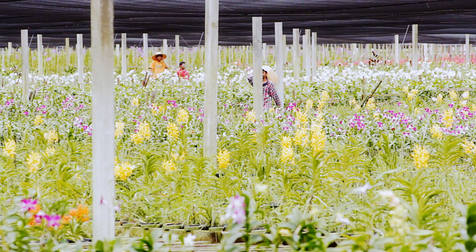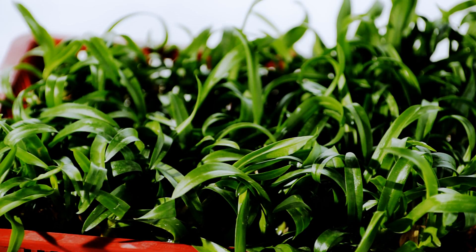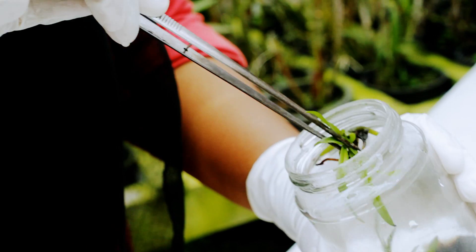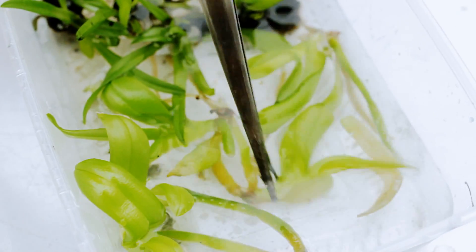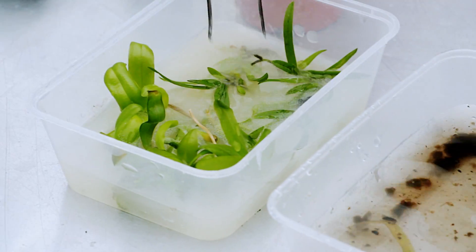The plantlets must undergo one more stage before they can become fully grown plants. They must be planted in a new medium, which is made up of a combination of clean moss, charcoal and water. To do this, the plantlets are first soaked in a mixture of water, soluble fertilizer and Thiram. Thiram is an ectoparasiticide, which means it prevents fungal diseases in seeds and crops. It also acts as an animal repellent.